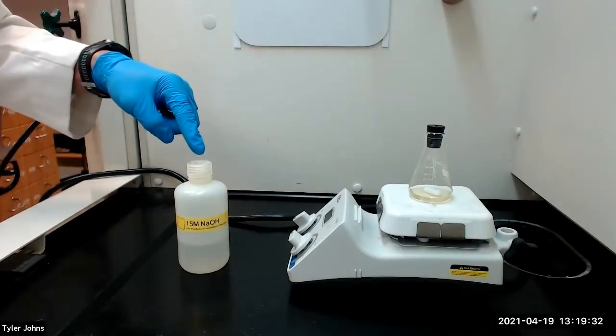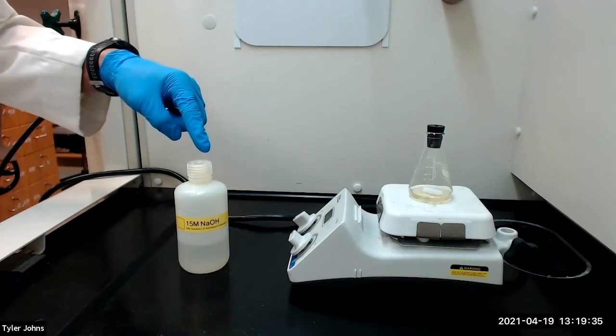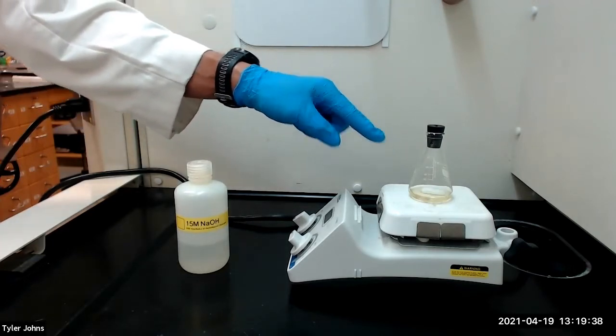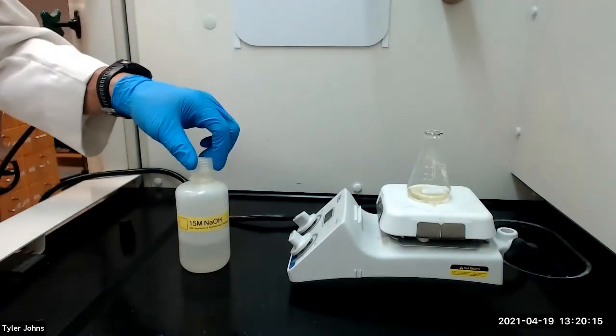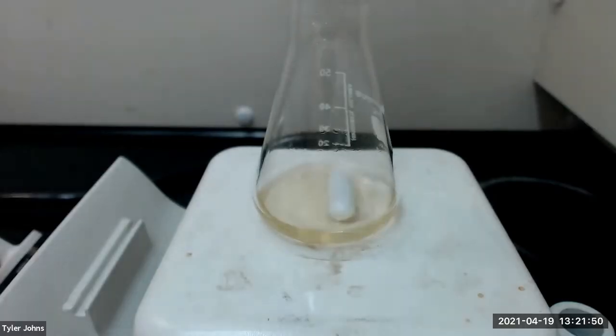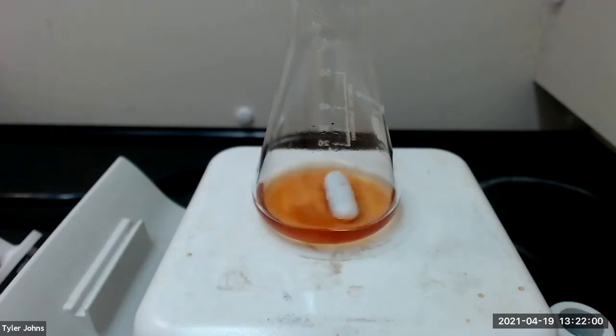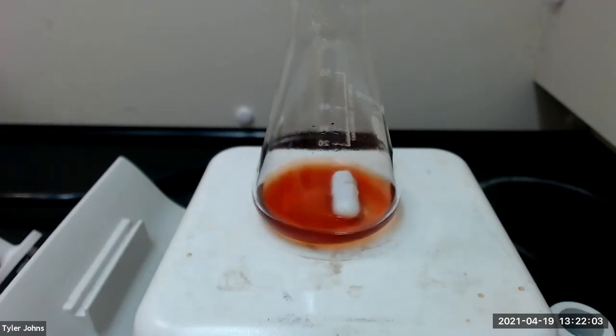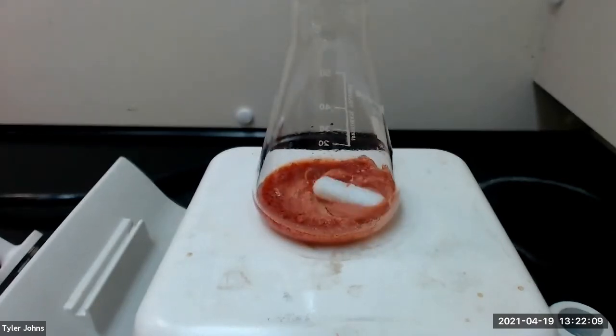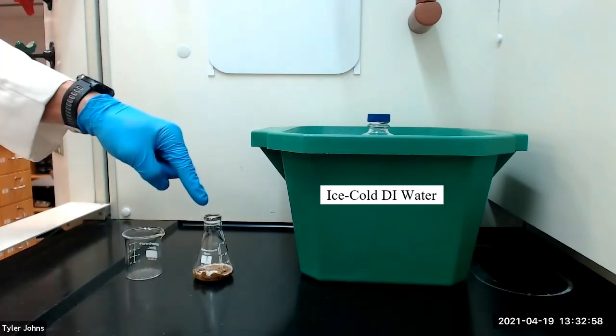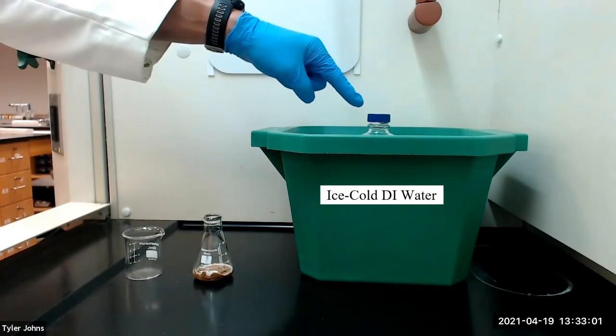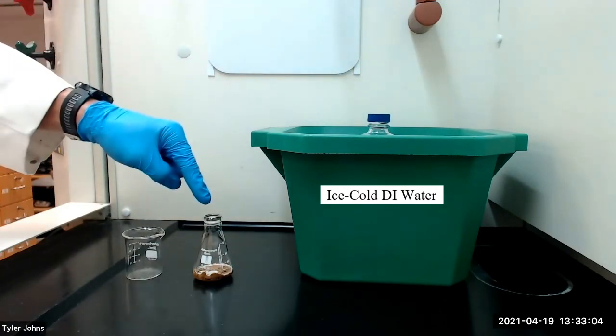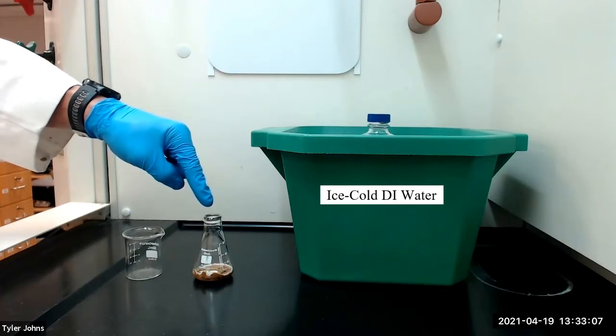We will next add 0.5 milliliters of 15 molar sodium hydroxide solution to the mixture in the flask and stir until a precipitate forms. After a solid precipitate has formed, we will add 10 milliliters of ice-cold deionized water to the mixture in the flask and stir with a micro spatula to break up the solid mass.